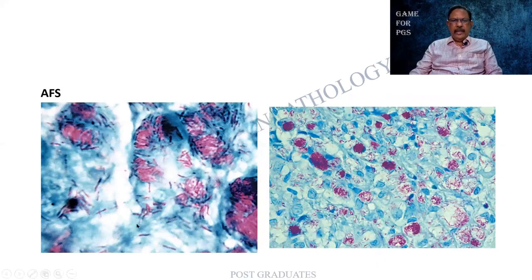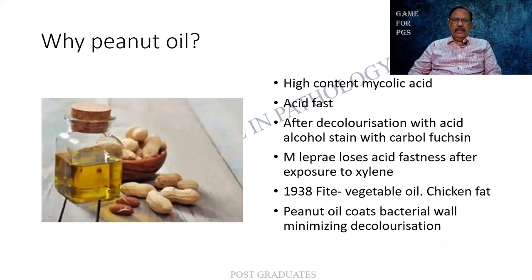And in this, I am finding the conventional acid-fast stain and the recent modification of it. So, if you are technically superb, you will be able to see that there is a fine difference between these two pictures. Also, do observe that there are large vacuolated cells in the background which are harboring the bacilli, which are seen in clusters. Maybe they are called the globi. The question that we had asked earlier: why do you use peanut oil? I could have used xylene itself.